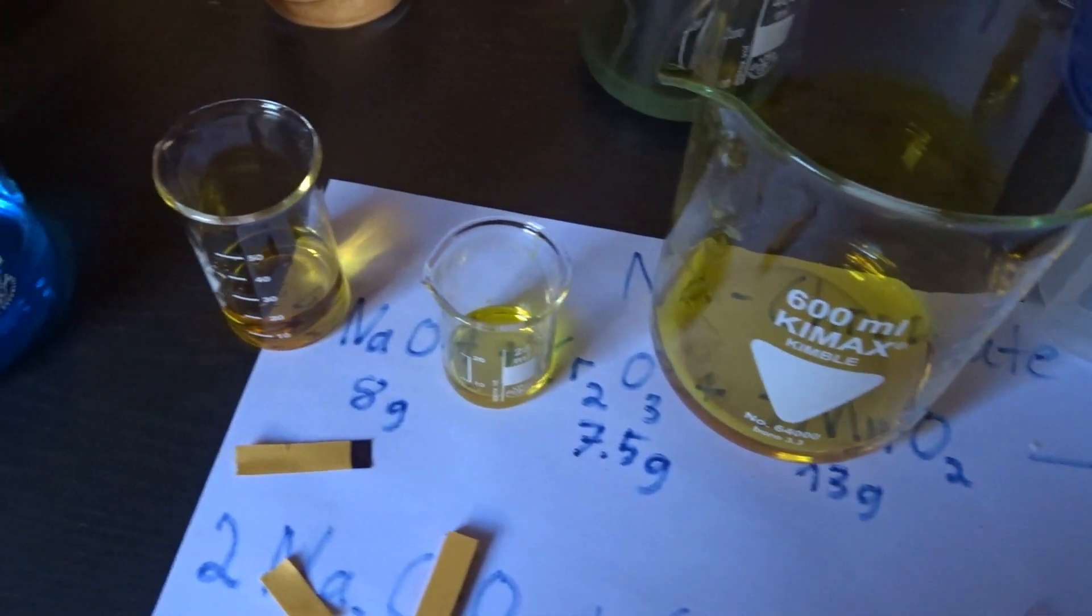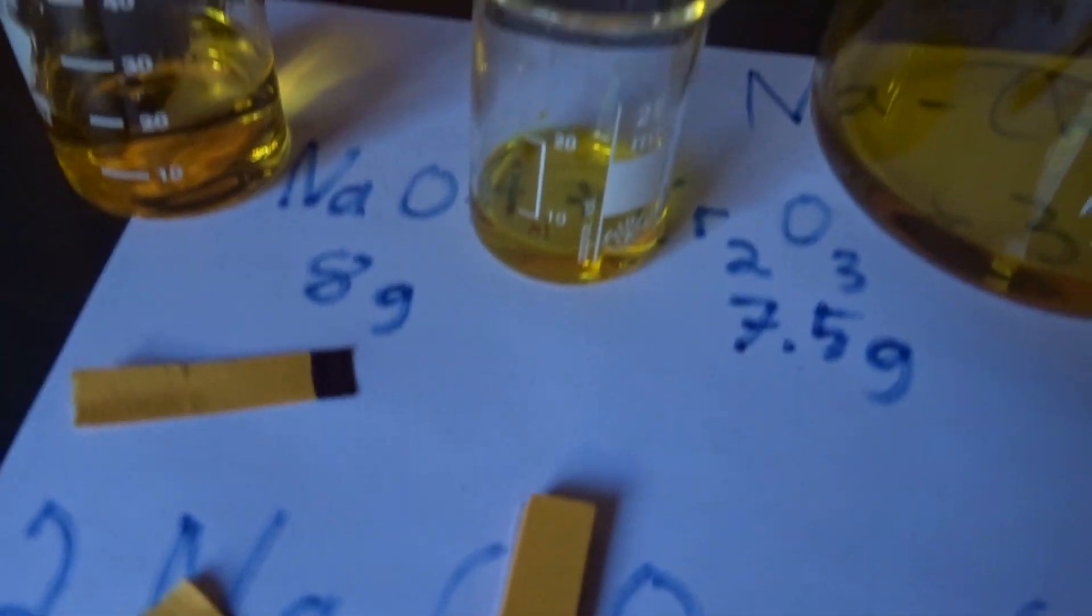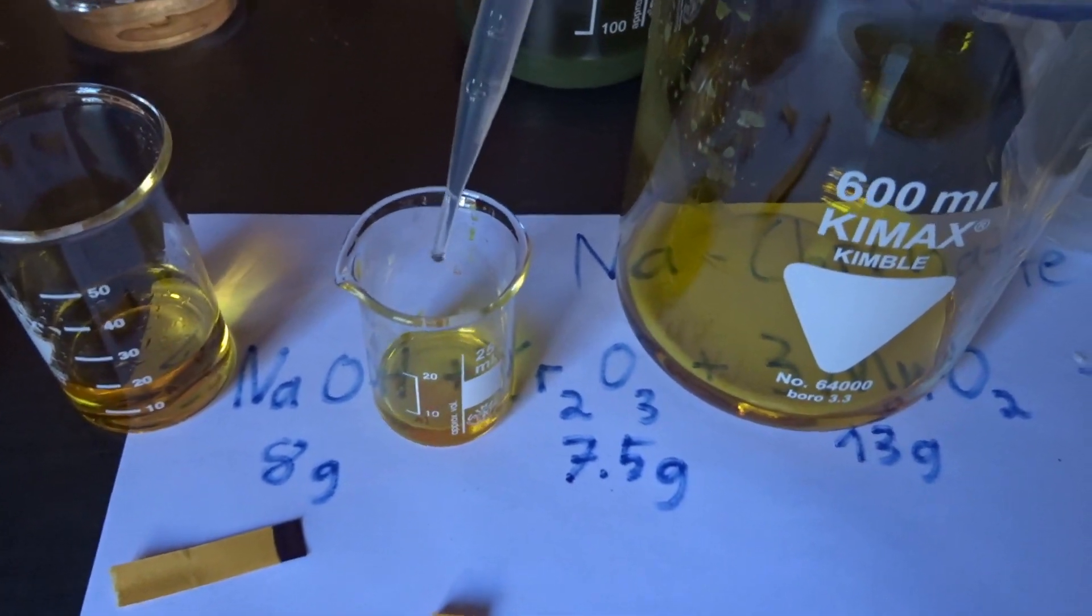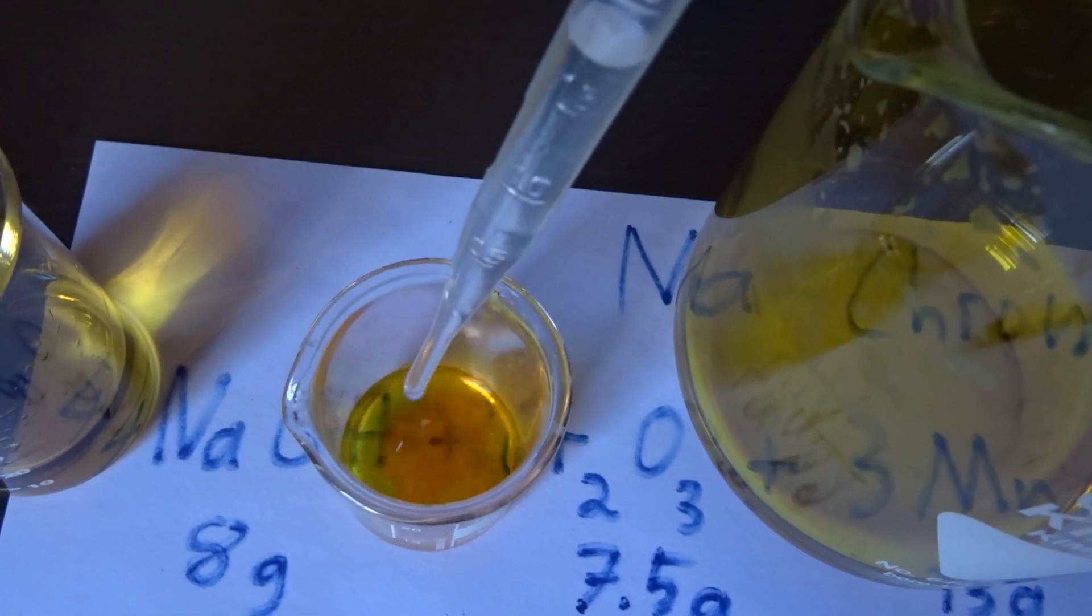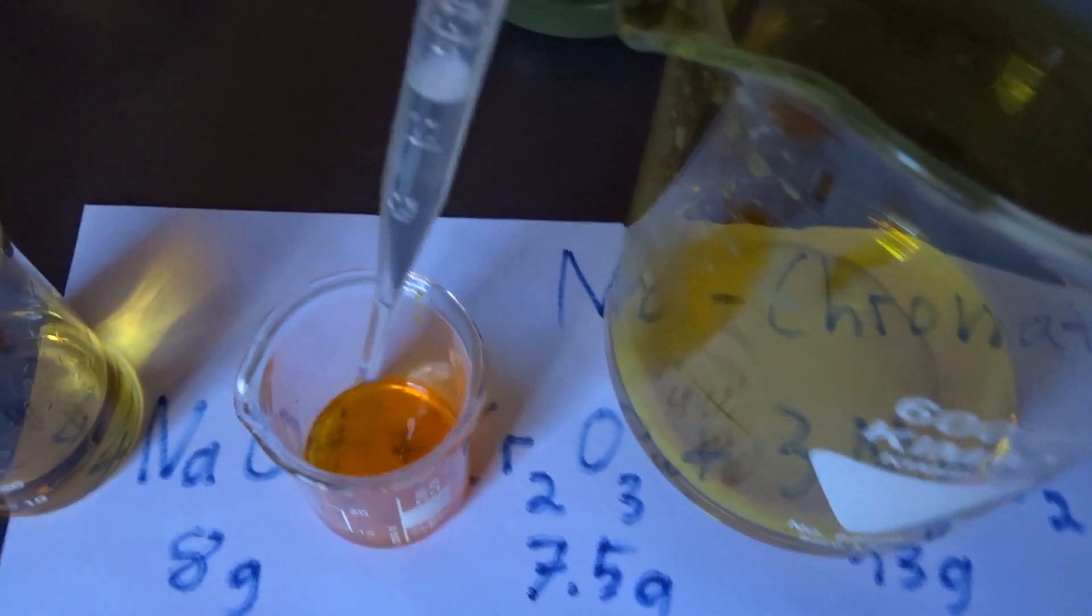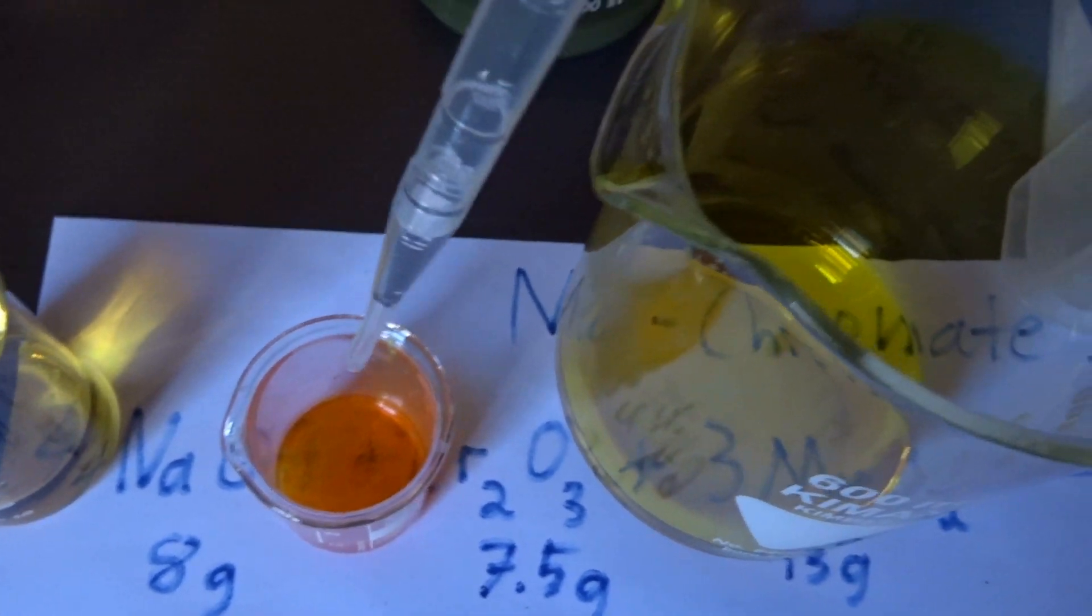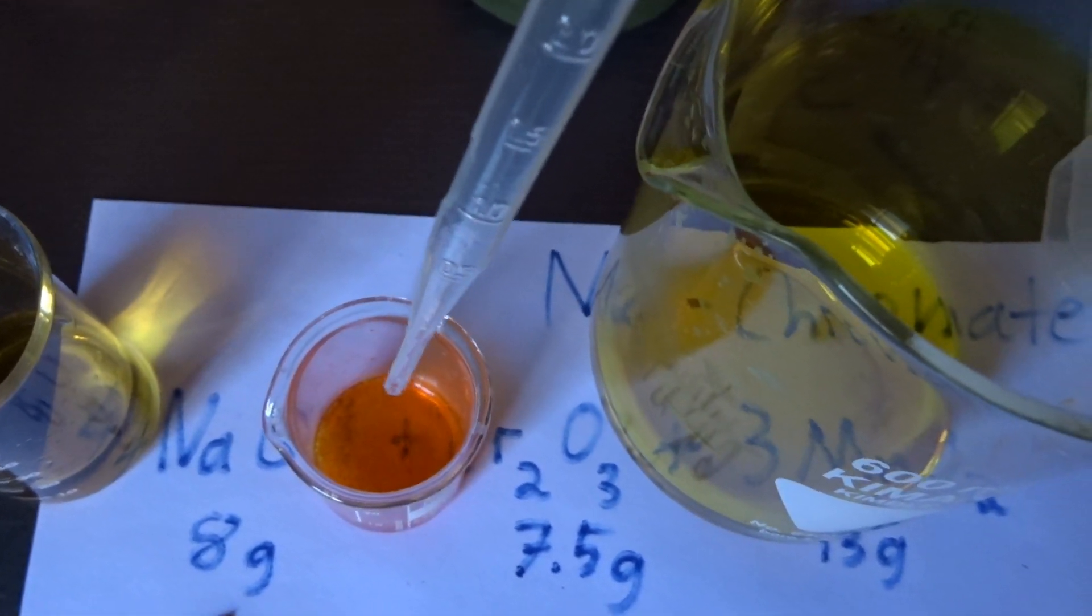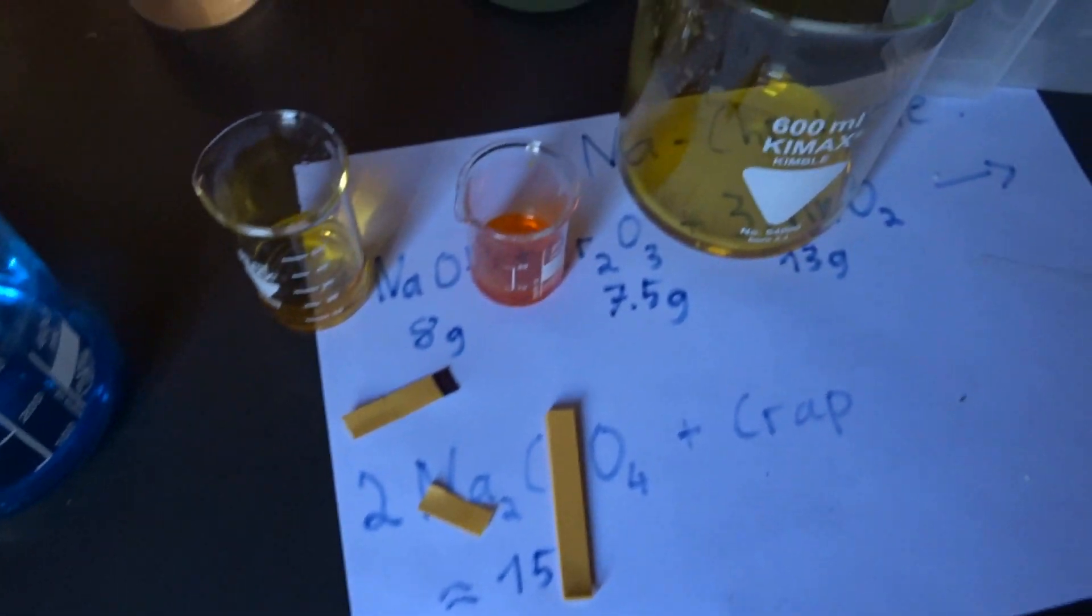But first I want to demonstrate the chromate dichromate transition on this little example. So I'm slowly going to add some sulfuric acid and you'll immediately see the color change forming dichromate. And probably some CO2 gassing out. Maybe some carbonate made it in there. I don't know.